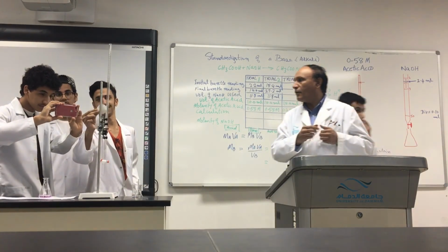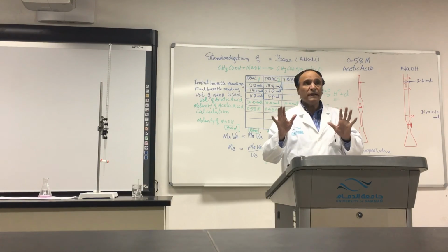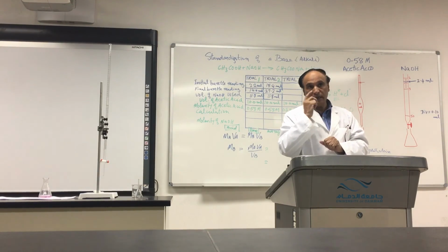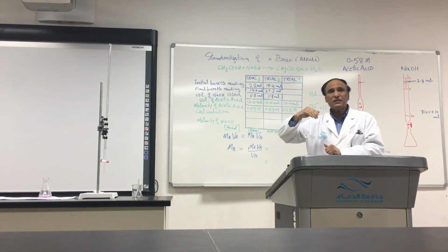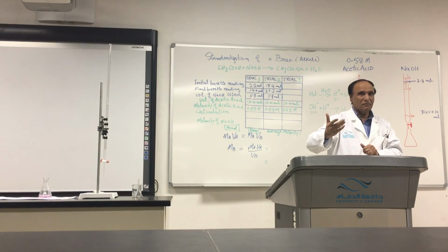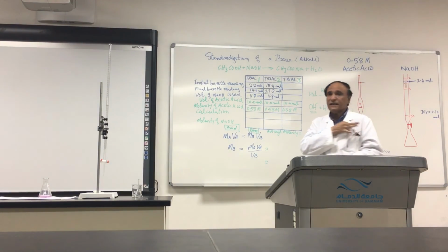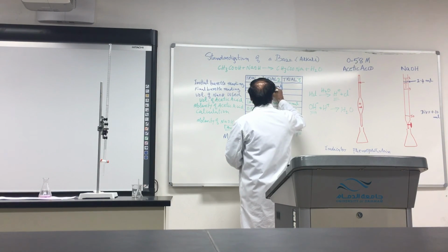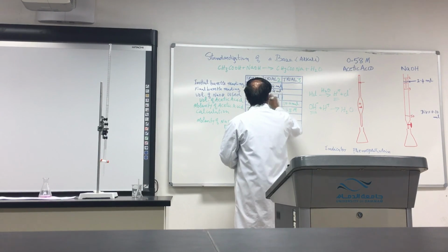Okay, boys, now listen, no talking, please. This is 27.2, but since you are doing it the first time, maybe you will make some mistakes. If, for example, you get 27.3 or 27.4, no problem.